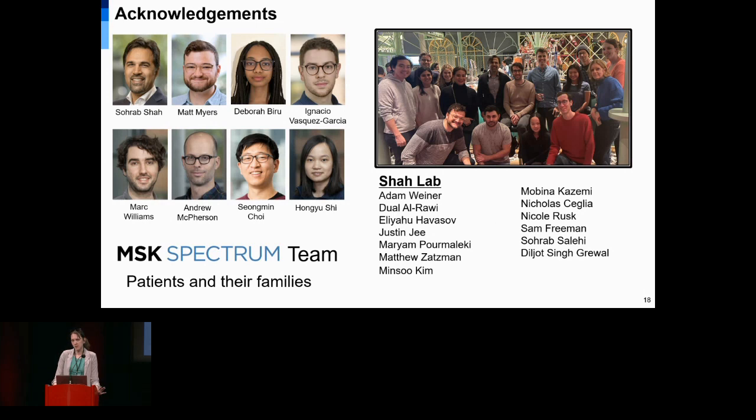So on this data, where we're typically getting usually about 0.05x coverage, to train the model, I think we need probably at least 10 variant reads to be able to call something confidently shared subclonal. So to train the model, we need reasonably good quality or a lot of cells. But then to apply the model, we've had success going down to as low as 80 cells in terms of filtering out artifacts. Okay, thanks.